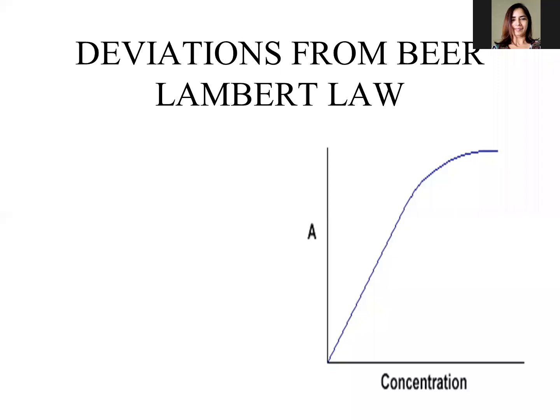At higher concentration, the law deviates from the straight line, and I've shown only the negative deviation. If the straight line turns upward, it's a positive deviation.